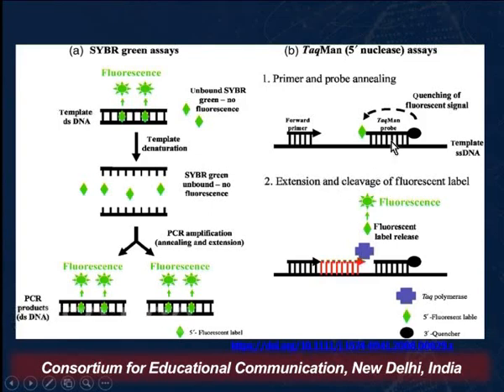So what we use here are what are called probes. If you remember, the probes are the ones which are attached to some signal-producing molecules that can produce the signal. So in here you can see they are the locus specific probes. That means they will bind to your gene of interest or the template, and it contains two molecules.